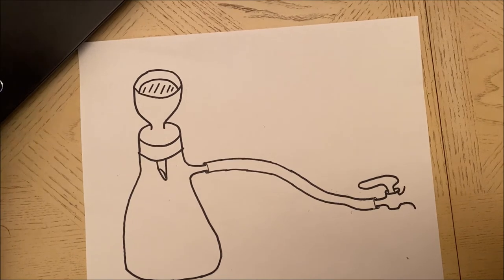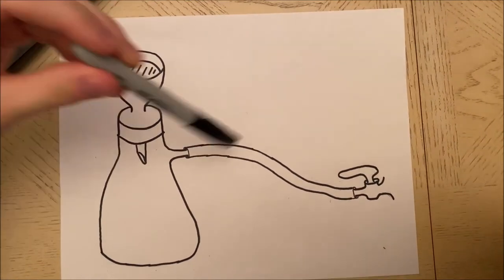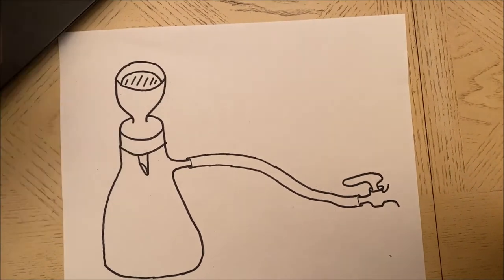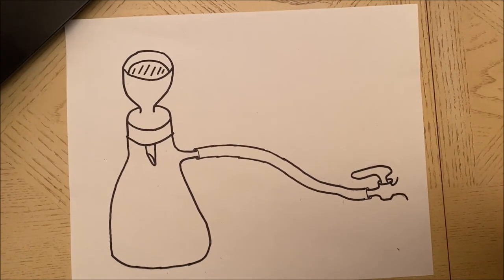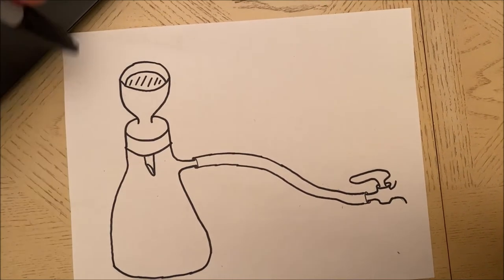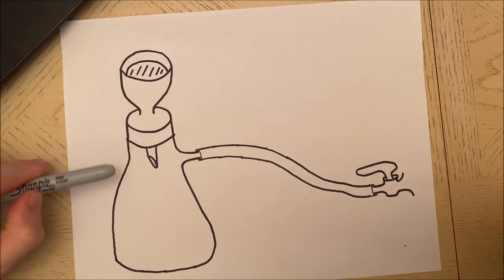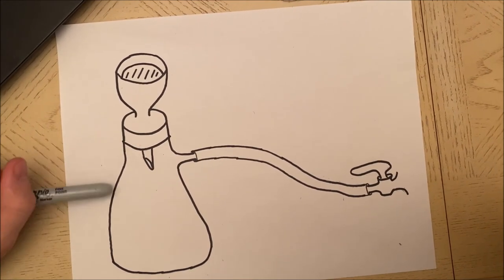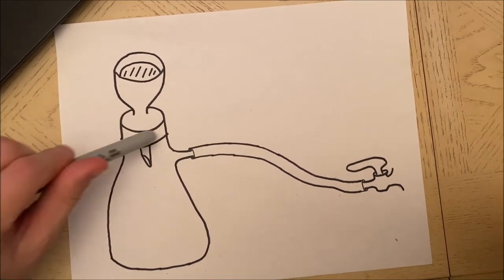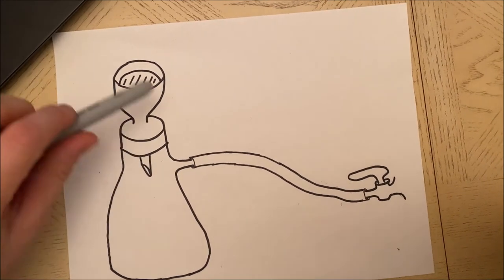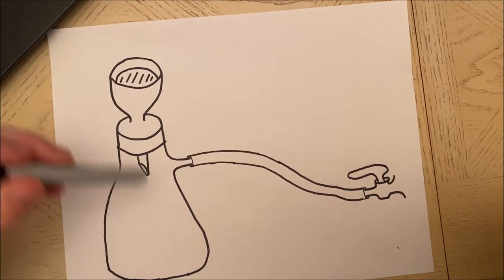Now I'm going to explain how we're actually going to proceed with vacuum filtration. I have everything drawn already but I'll explain it. First thing we need to do is add the Buchner funnel to the Buchner flask with its rubber funnel adapter right there. This keeps everything sealed airtight so nothing can escape.